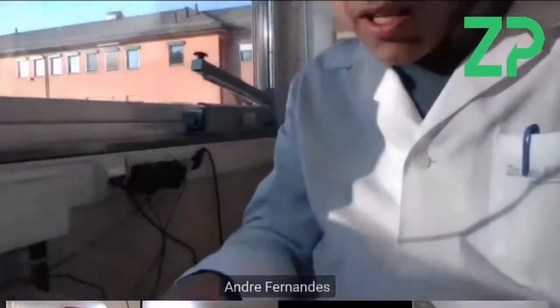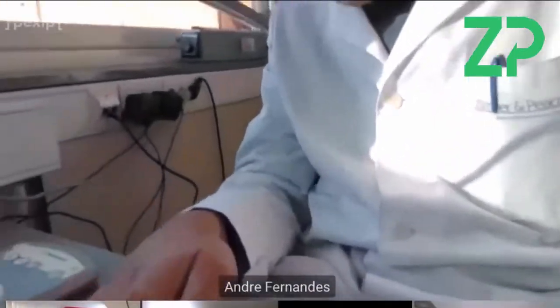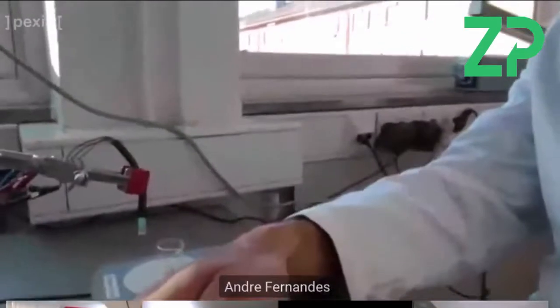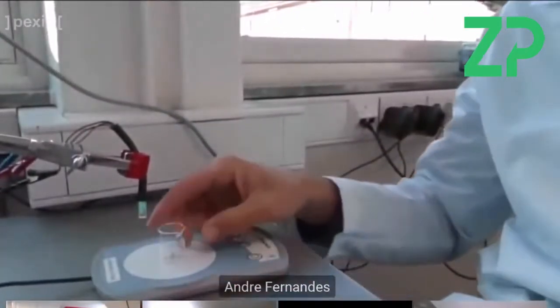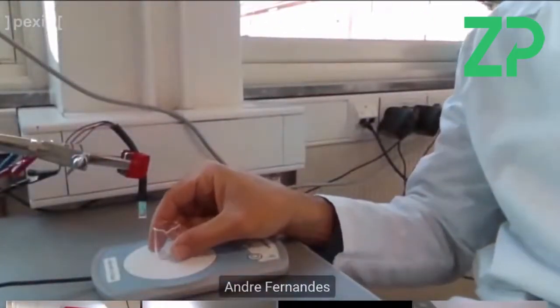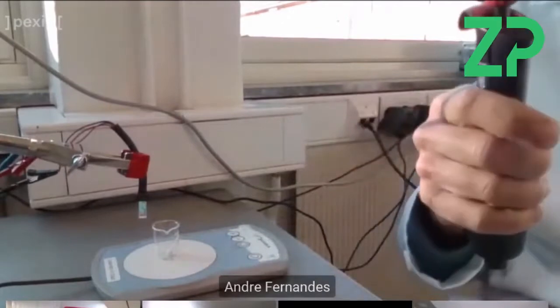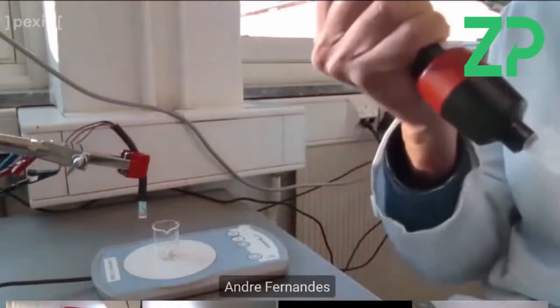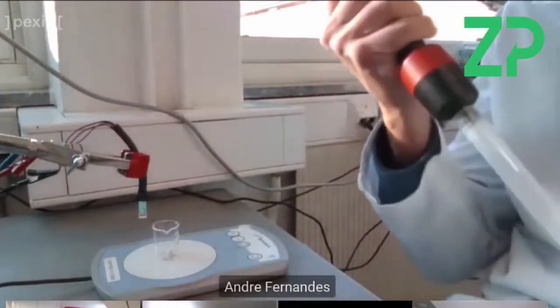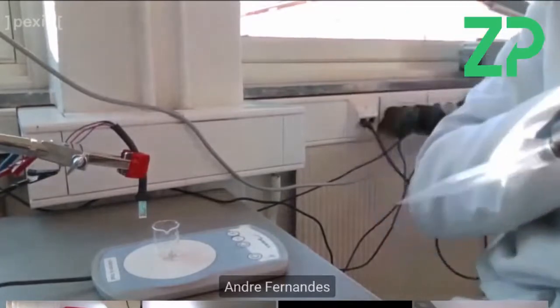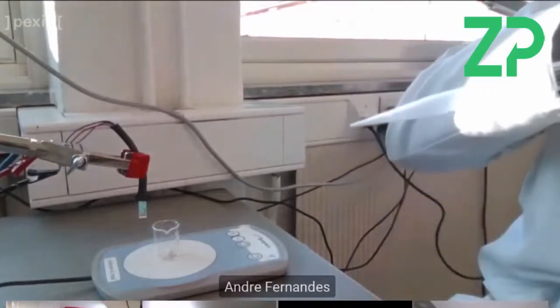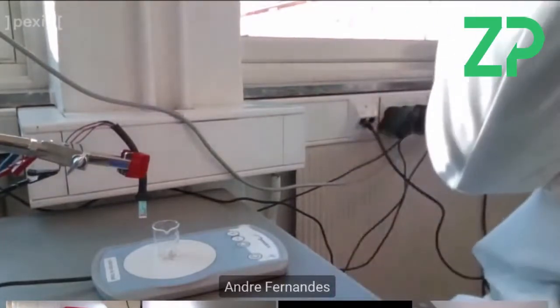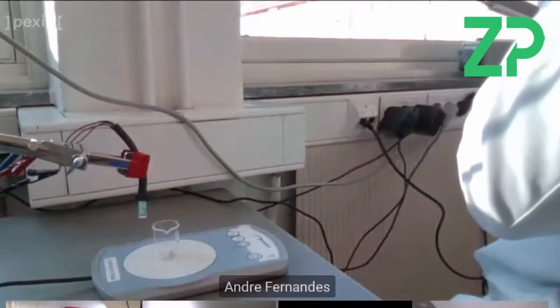So I'm not sure if you are able to see what I am showing, but basically I have a beaker here and what I'm going to do is I'm going to pipette five milliliters of a phosphate buffer solution.